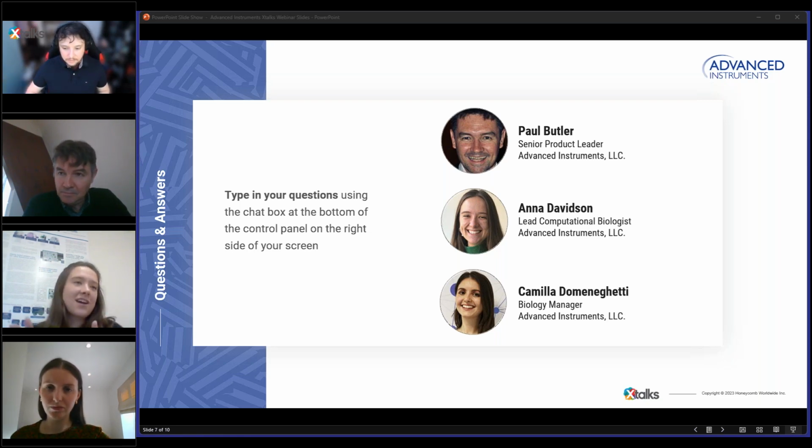I've got another question here, wondering, does the neural network continue to learn after the install? I will take that one. Another great question. So this network doesn't continue to learn. Once we've trained it up, and we think it's learned everything it can from the data set that we give it, we stop that training. So we have a fully validated network that doesn't continue to go off and do unexplored things during your customer data set.